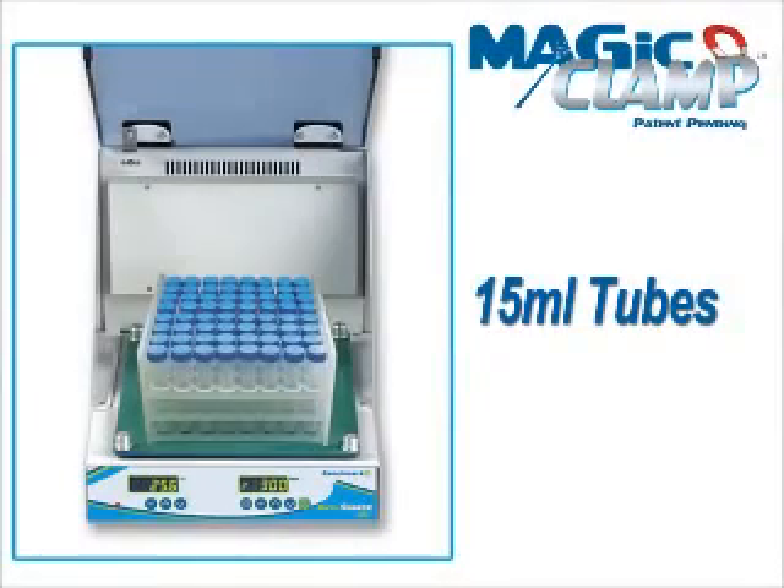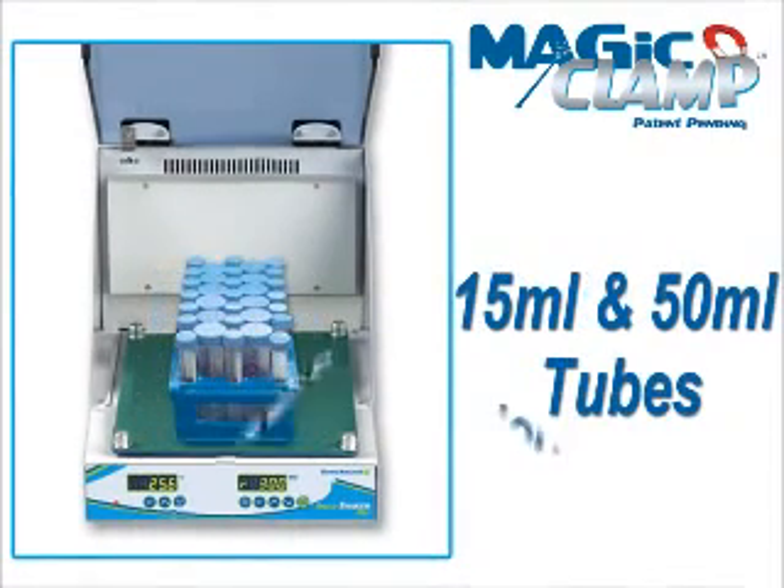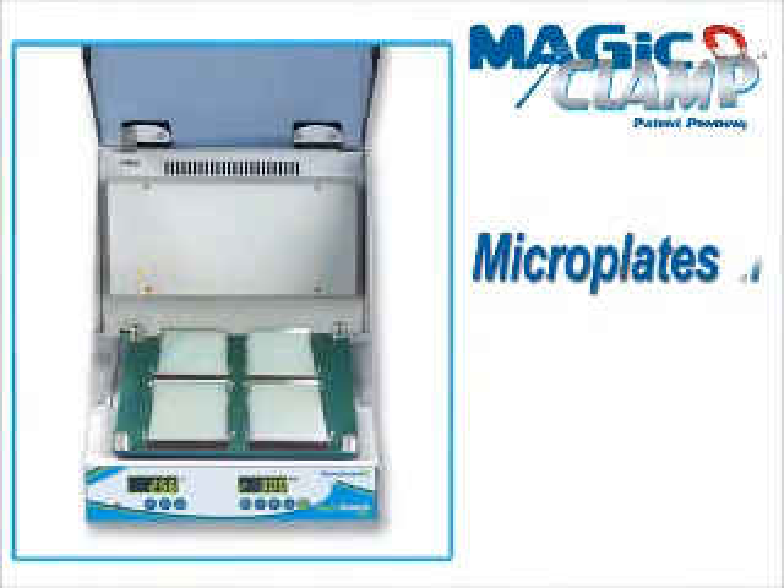In addition to convenience, the Magic Clamp System also adds versatility. While many traditional platforms are only designed to hold flasks, the Magic Clamp Platform holds a variety of racks for tubes, bottles and plates.